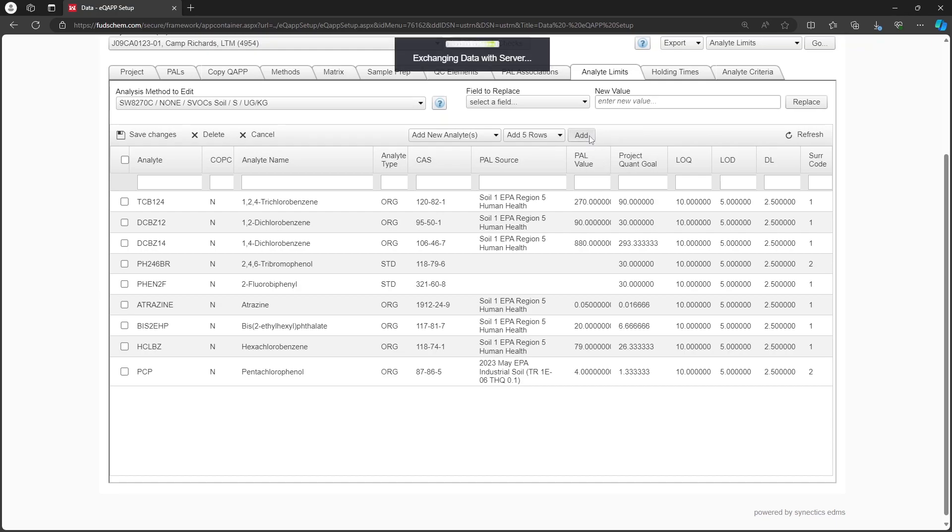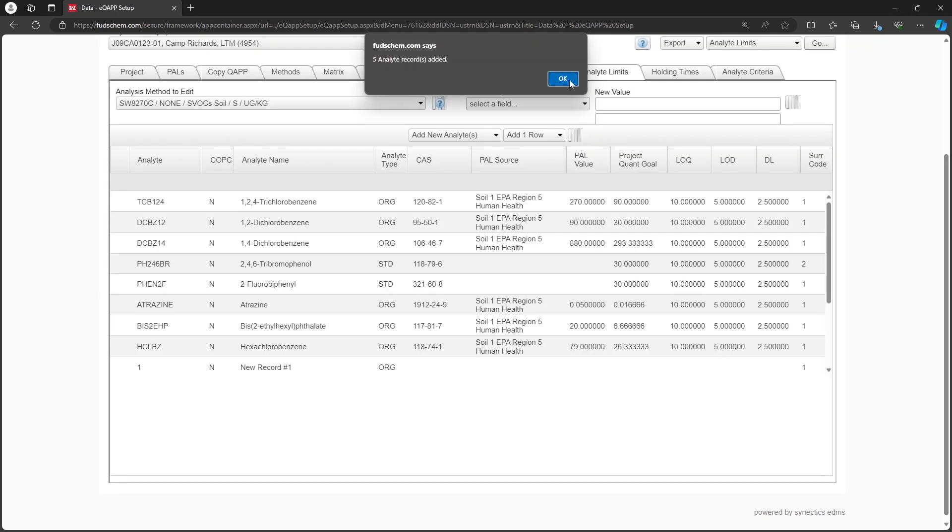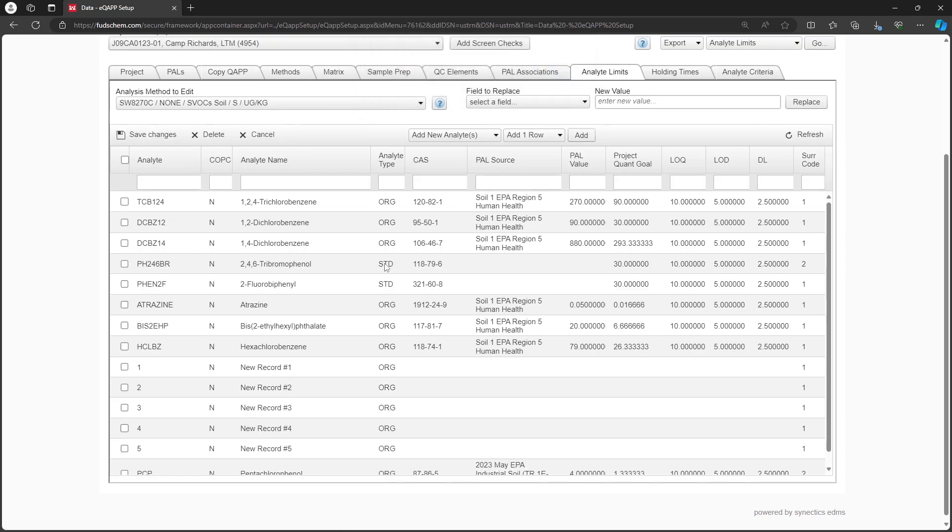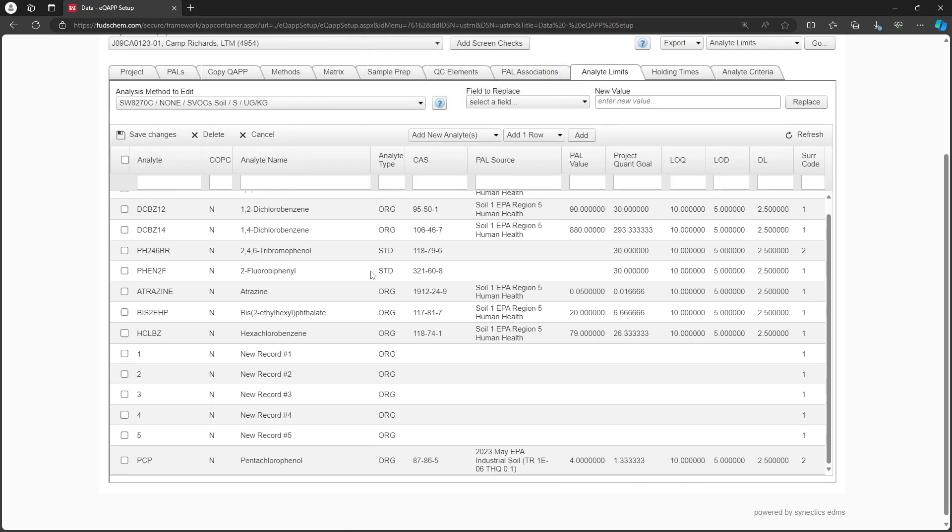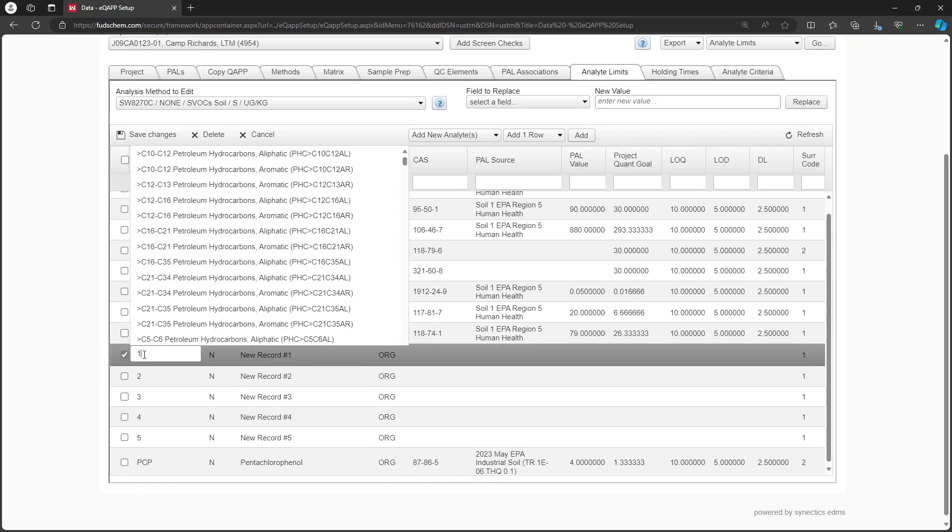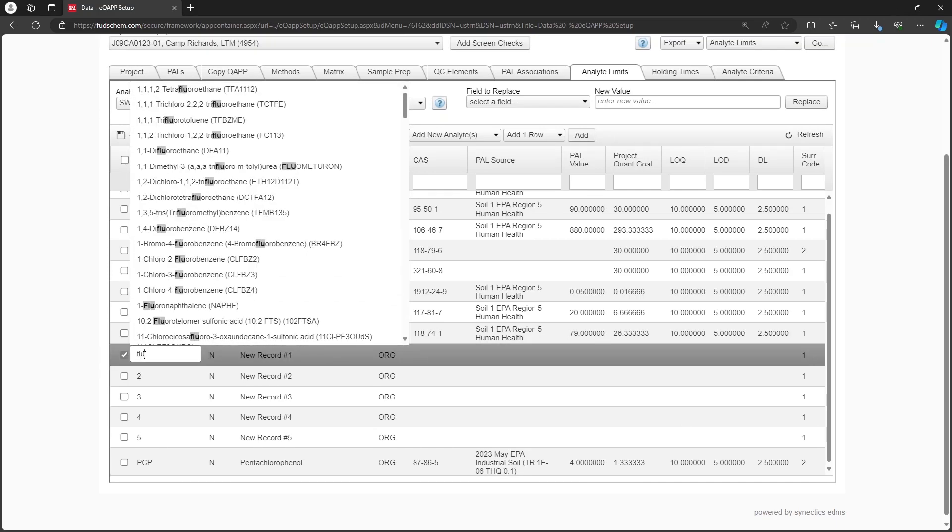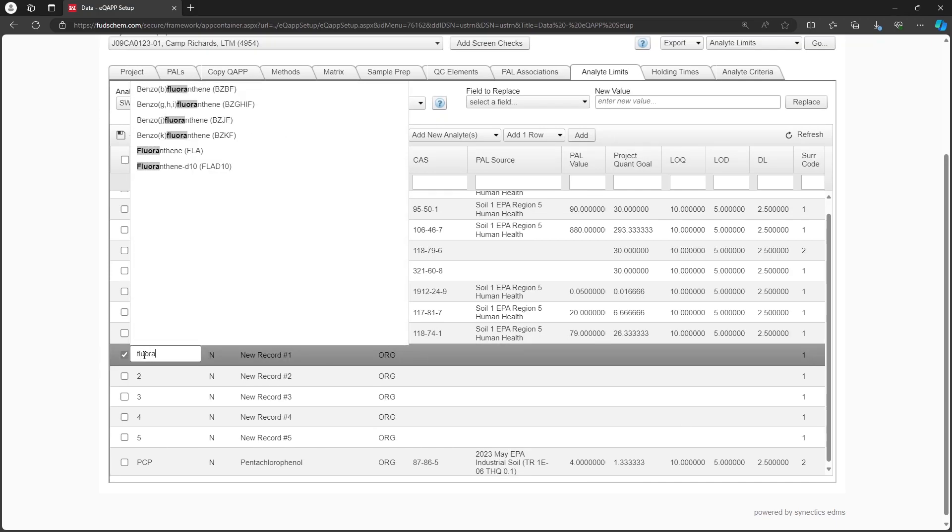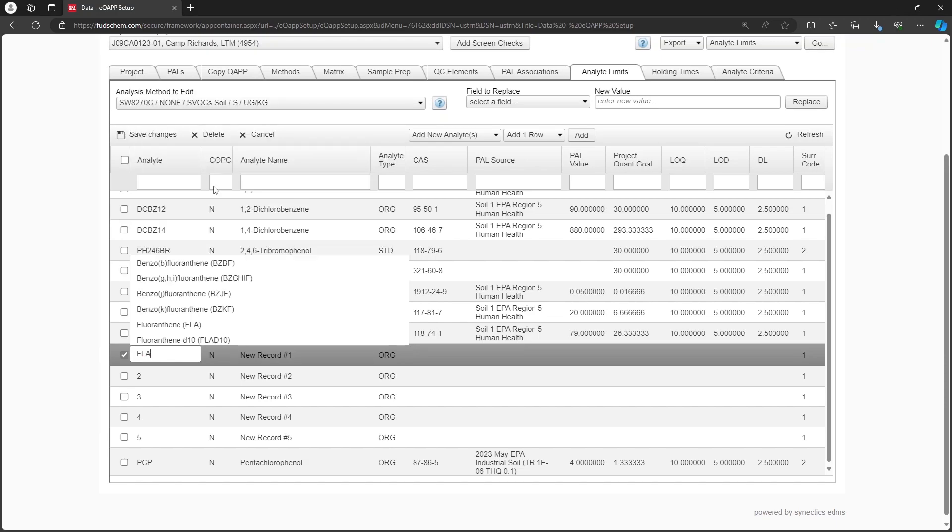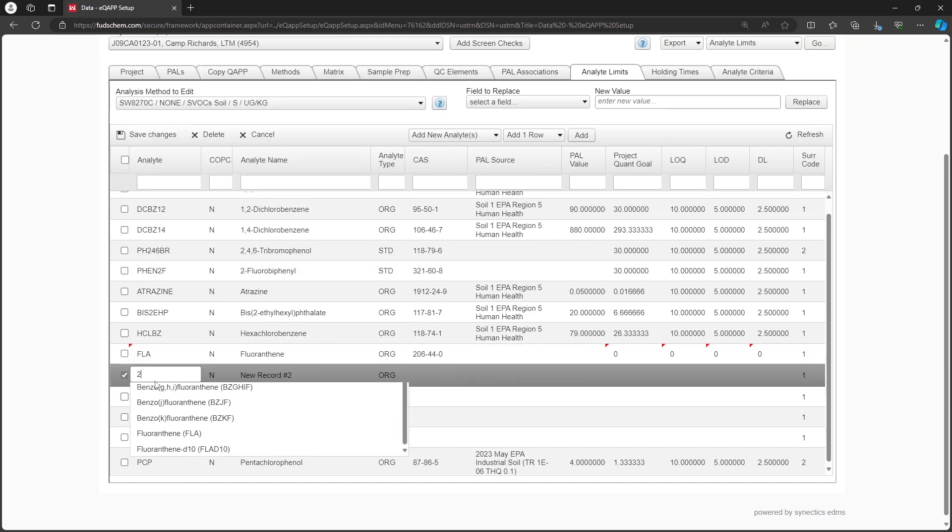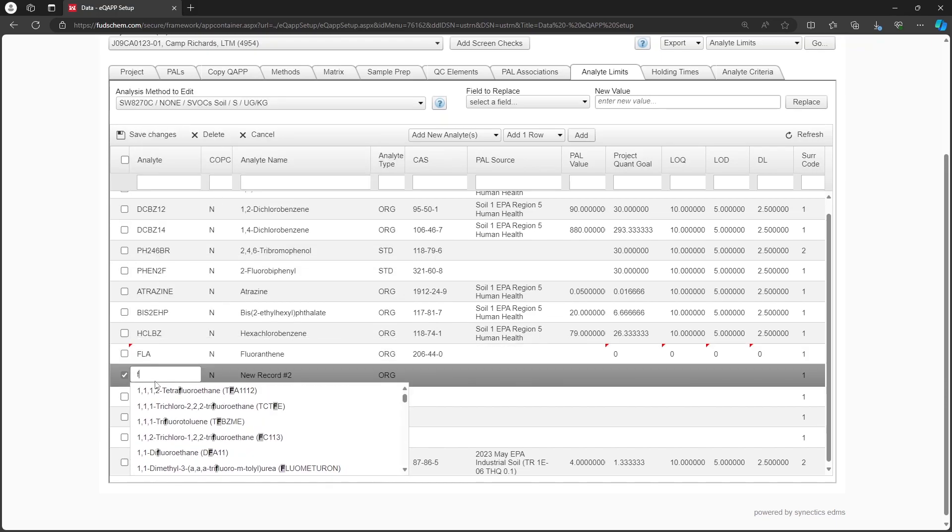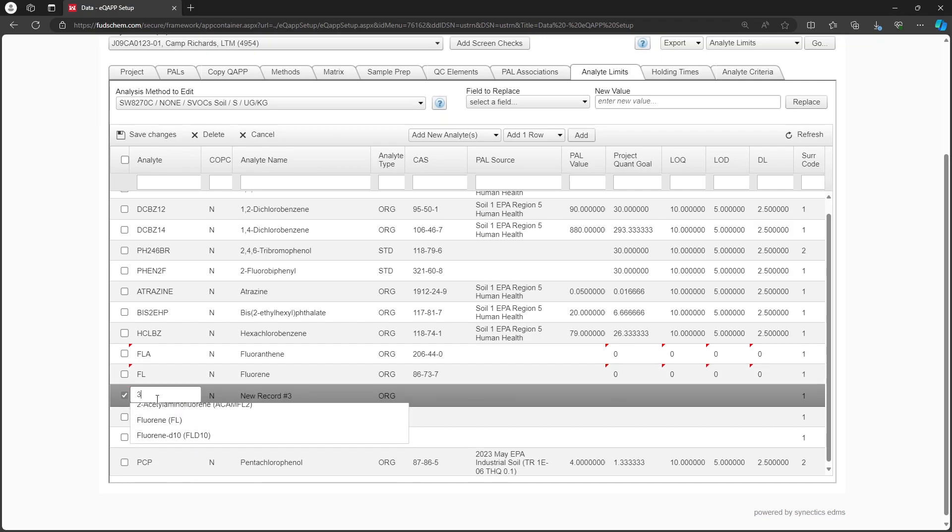Click Add. We can see the new rows are blank. We can click directly on one of the numbers in the Analyte column and set it to the new analyte. We will add Fluoranthene, Fluorene, Naphthalene, Nitrobenzene, and Phenol.